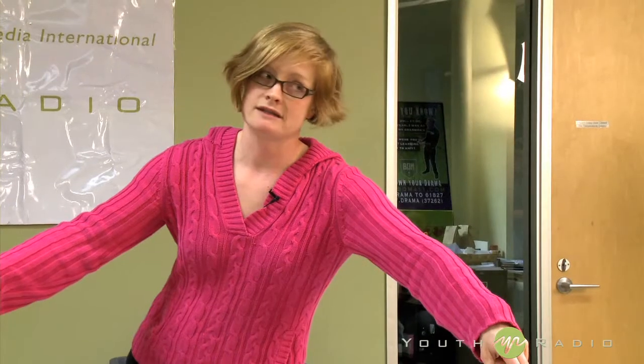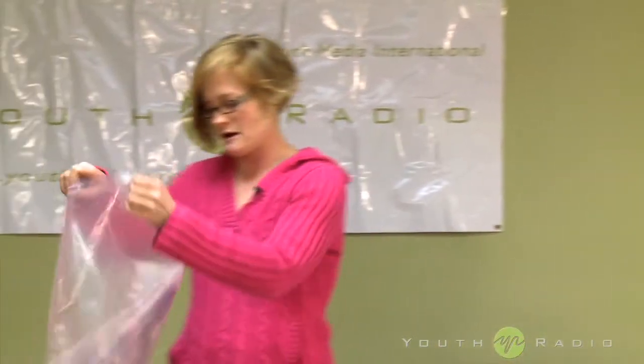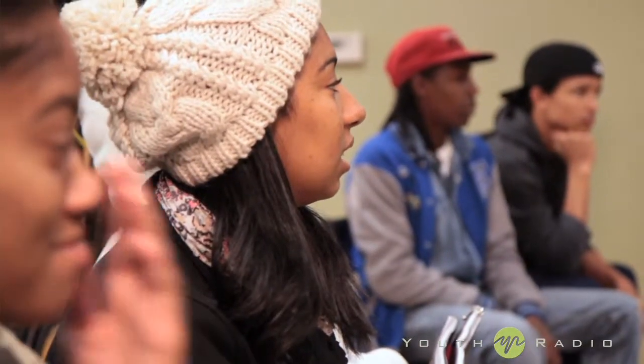We're gonna make a museum skeleton today. This is a Cooper's hawk and we're gonna take it from the whole bird right here. I get it ready for the dermestid beetles — flesh-eating beetles — and then make it into a skeleton.